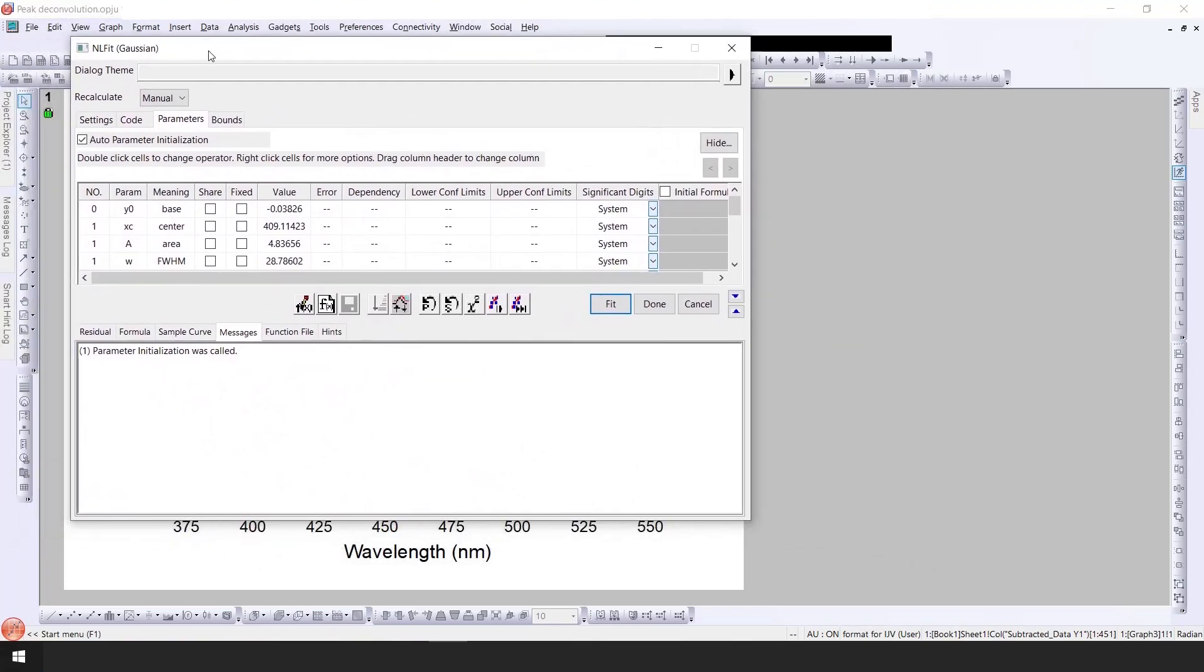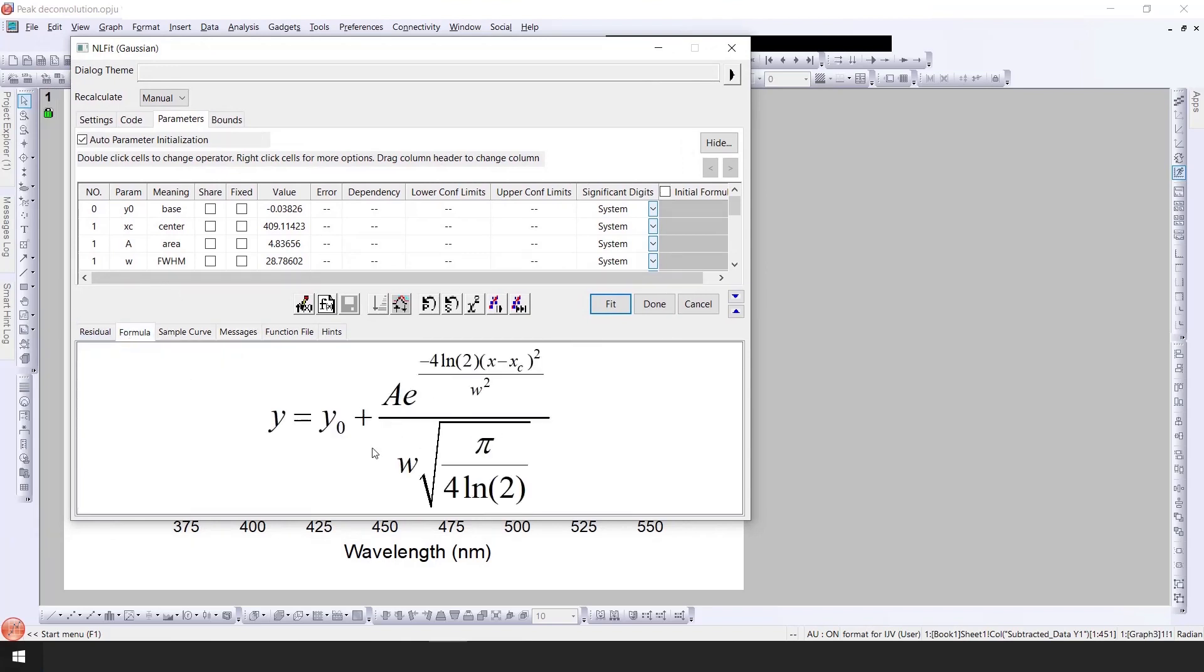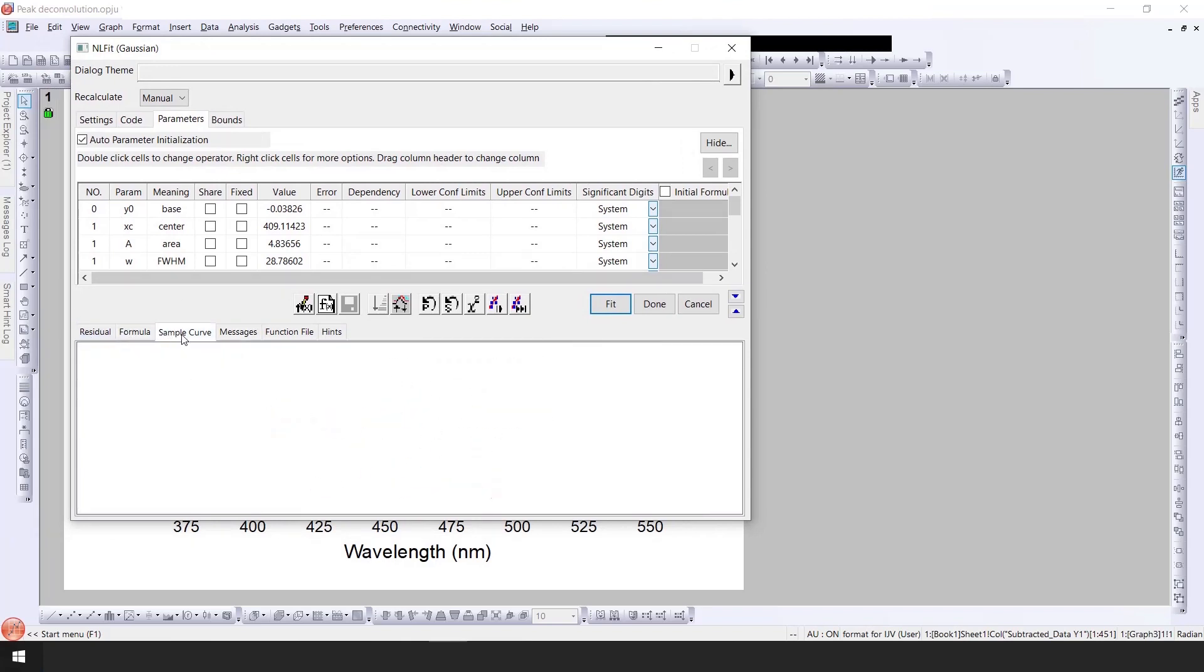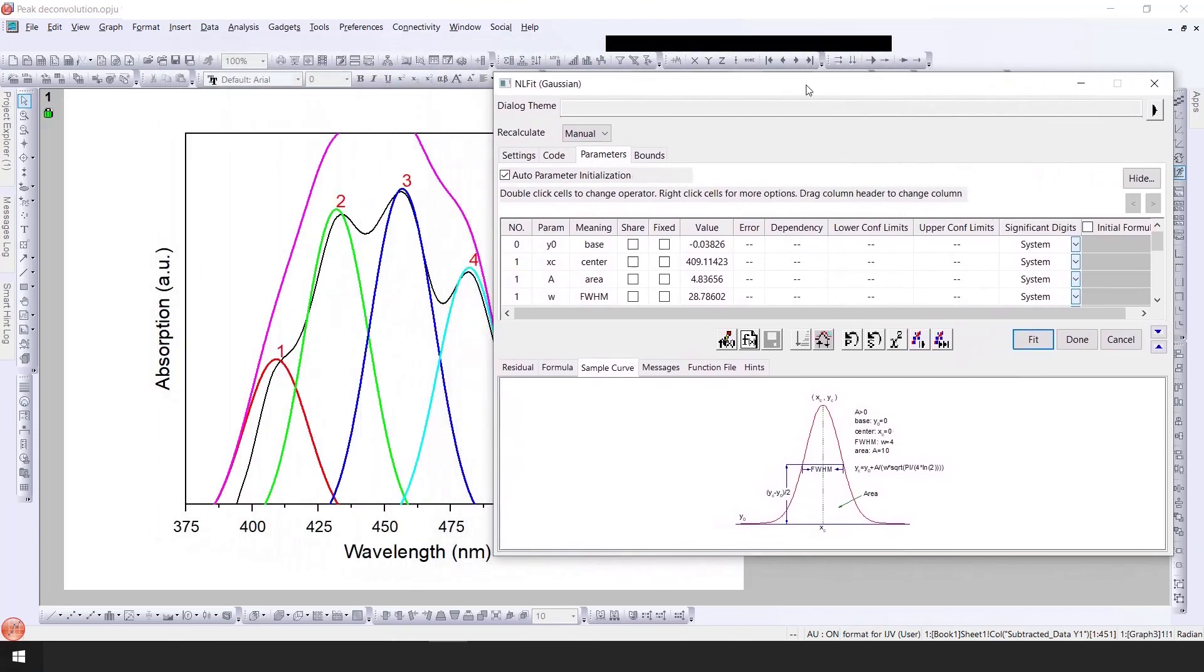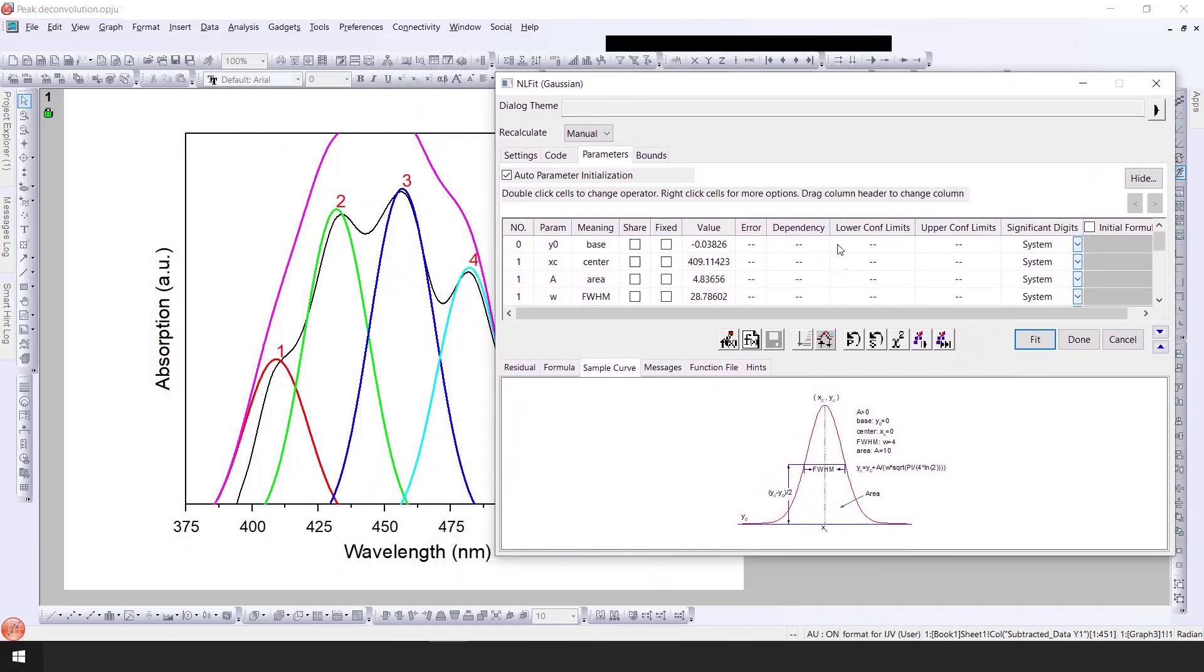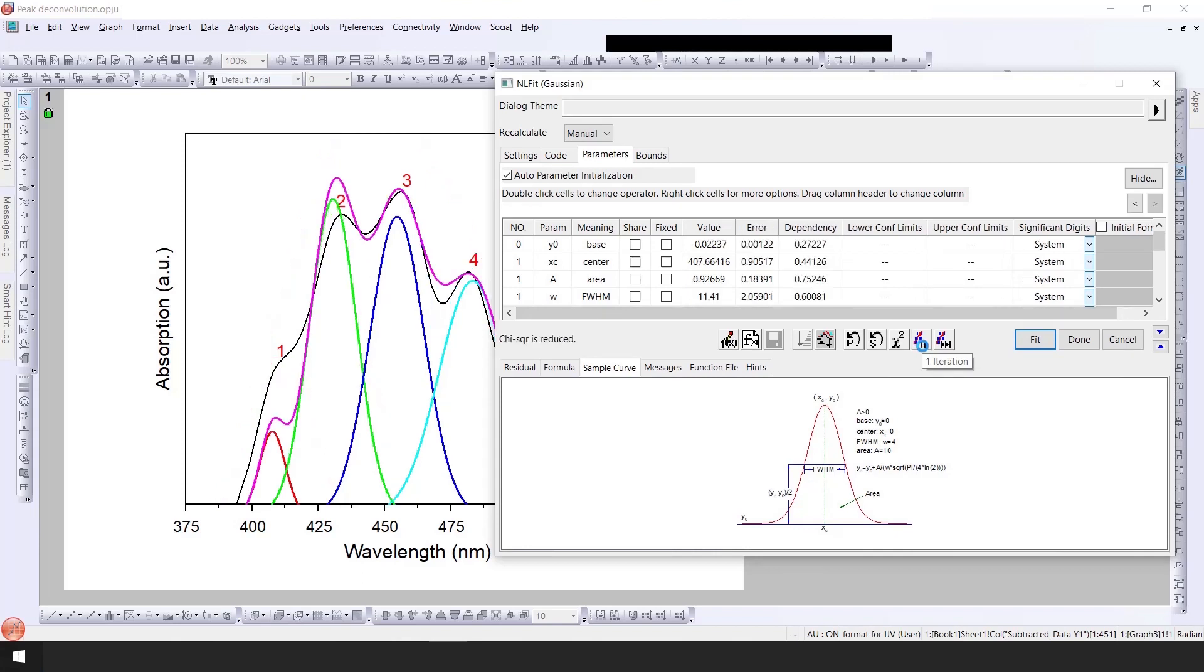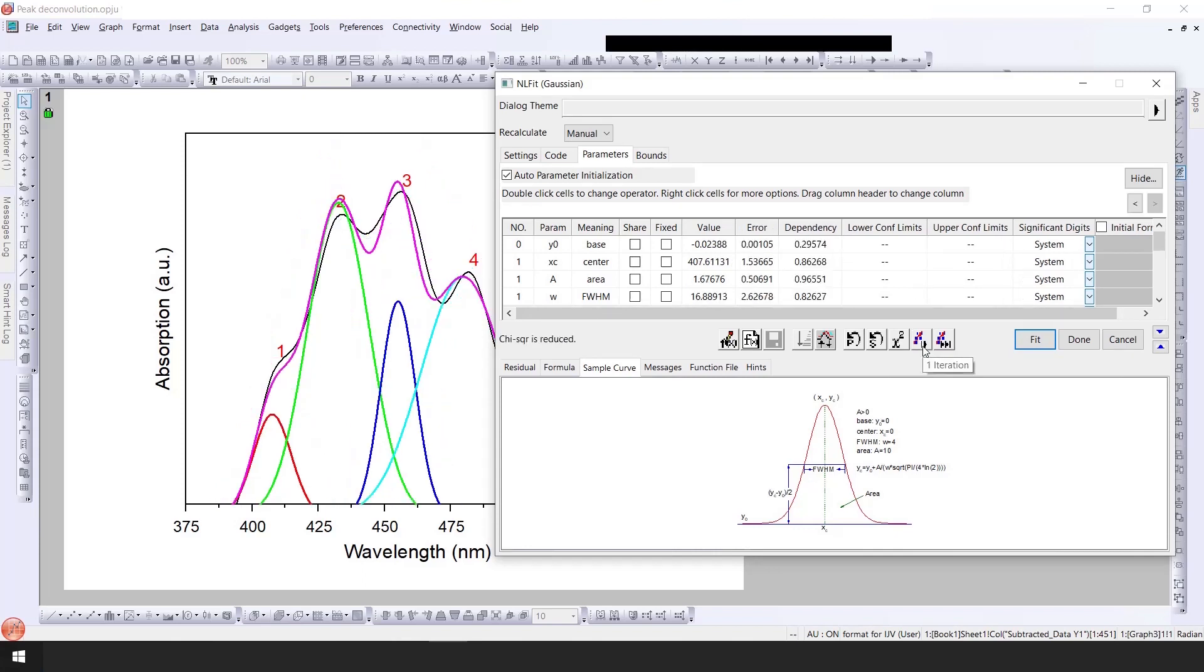You can see here we have used the formula of Gaussian peak fit and this is the sample curve. We do the multi-fitting or decomposition of the peaks in iterative manner by just clicking one by one iteration or we can simply click on this button to fit until the whole decomposition converges. Let me show you the peaks. If I click here it will show the first iteration and then second iteration.